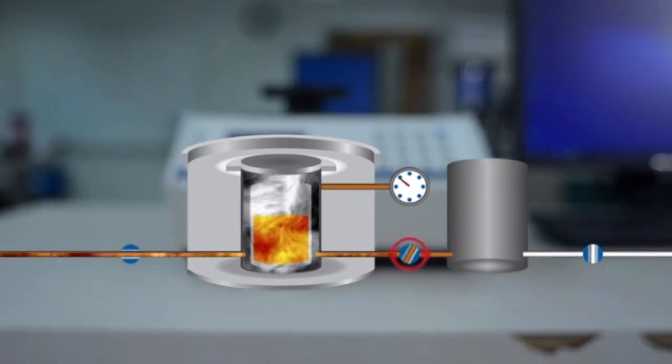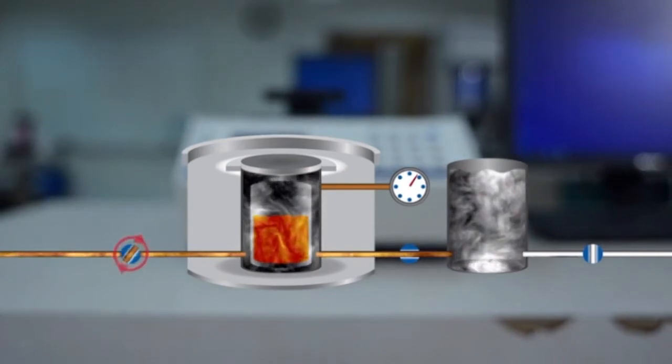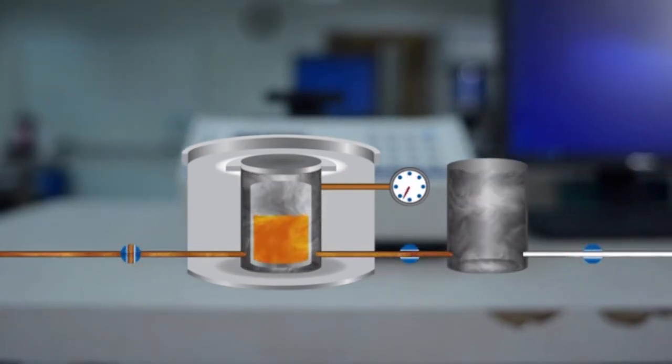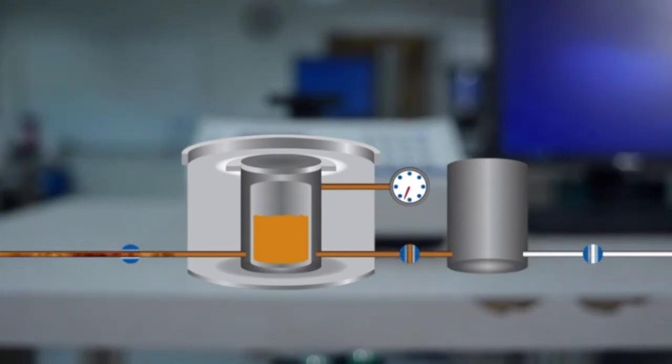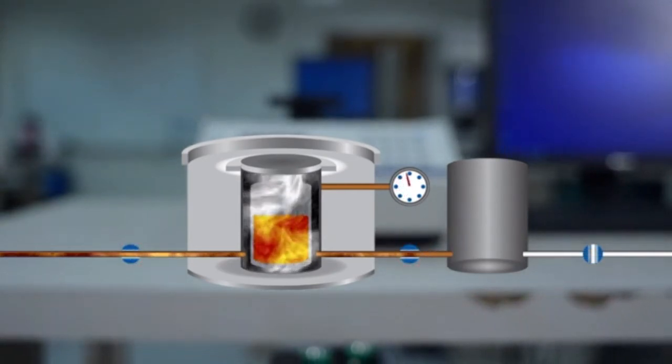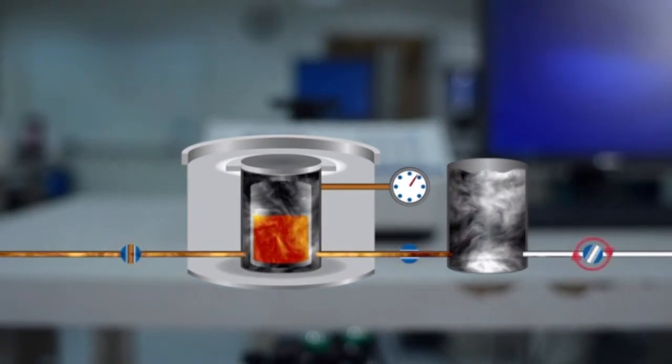The instrument contains routines to allow program purging of the sample chamber. We typically do this 10 times. You have the option to use anywhere from 0 to 999 purges. By filling the chamber and venting, it does a better job of cleaning the sample than just blowing gas over the sample.